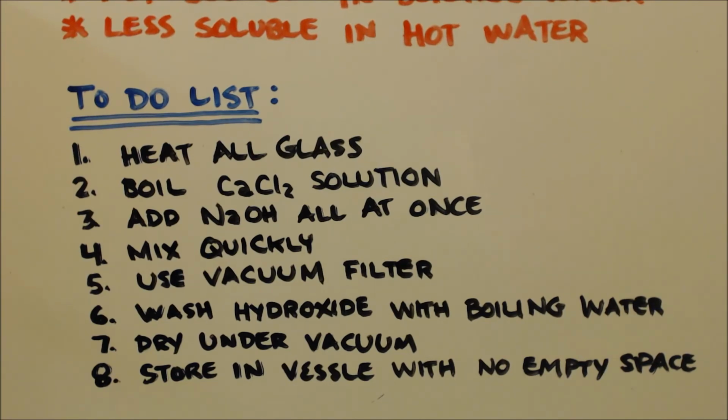Within 10 minutes, I could hear it starting to fizzle, like it's making CO2. You know what I mean? Within a half hour, 45 minutes, it's already starting to turn into carbonate, even though it's not even in water. It's just sitting there, you know what I mean? So it's that quick.